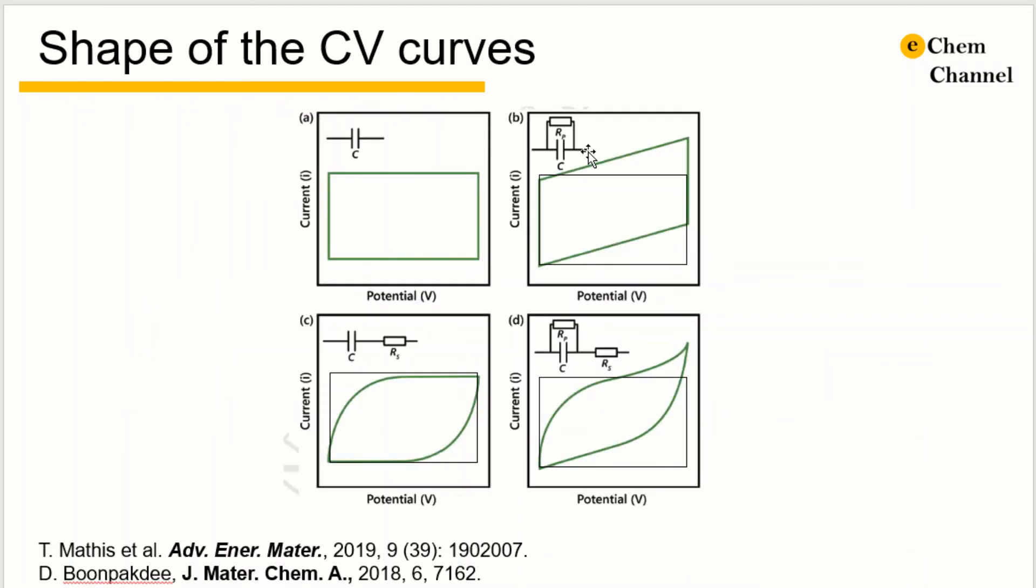The CV curve for the same material could be a lot different due to the fabrication methods and the different type of devices we use. For example, an ideal defect-free single layer graphene electrode should have a perfect rectangular shaped CV as it is ideally electrical double layer capacitive. However, three other CV curves could be observed in practical experiments.